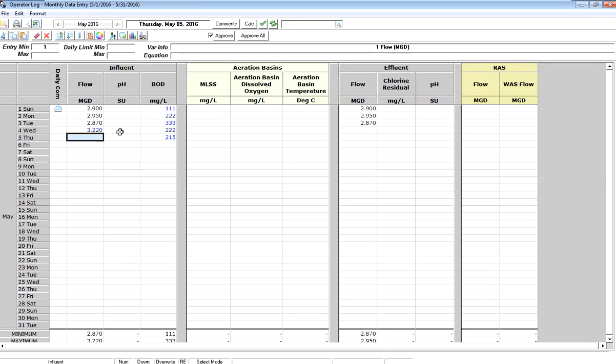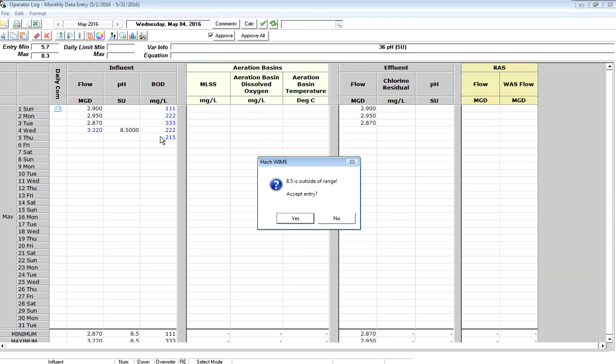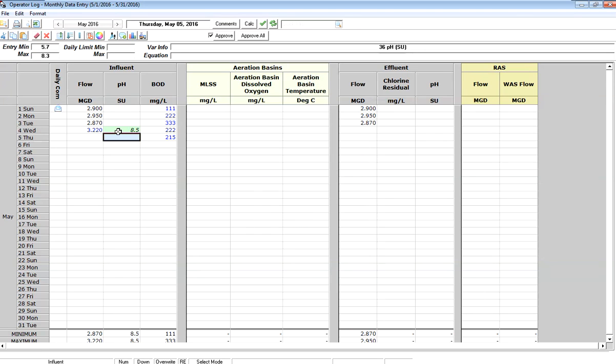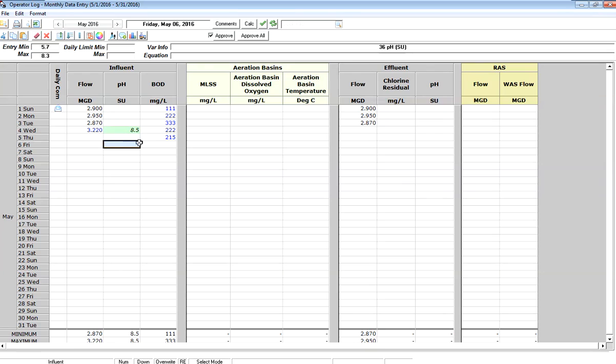If I go to pH and I type in my pH today of, let's say, 8.5, it comes up and warns me this is outside of the range. You've defined this as the normal range for pH on my influent. If I click yes, it's going to accept that. It's going to turn it italic and turn that cell green, indicating that it's outside the normal range. This is not a regulatory violation, it's just warning you that that data is not normal.